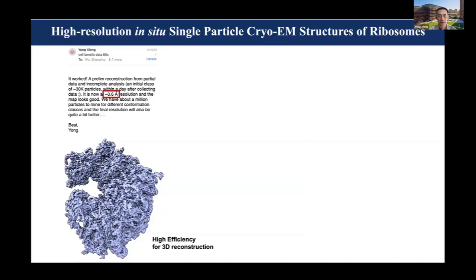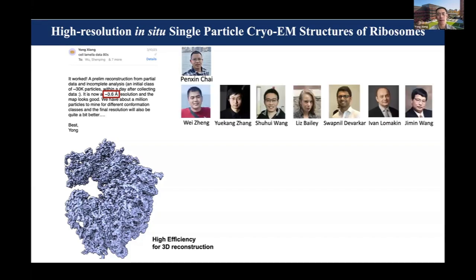This is an email sent out to the team on the second day after data collection. Everything just goes through the cryoSPARC standard pipeline. We get 3.6 angstrom resolution 1 day after data collection. Then we really got excited about this result. We started to assemble a large team to try to optimize the computational process.